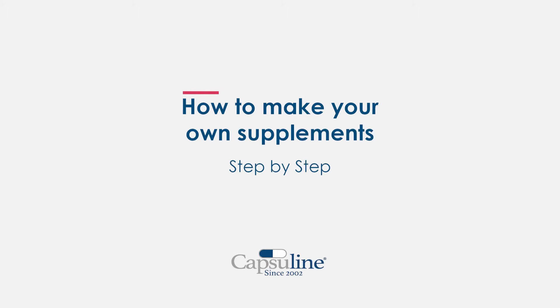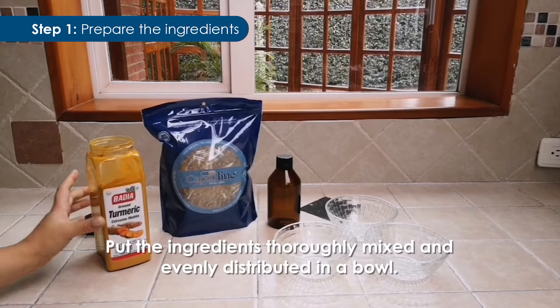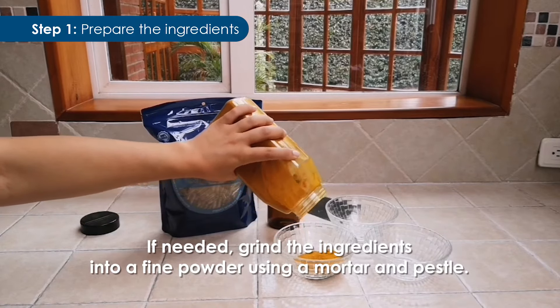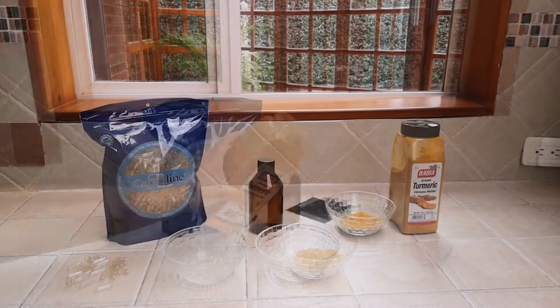Step 1: Prepare the ingredients. Put the ingredients, thoroughly mixed and evenly distributed, in a bowl. If needed, grind the ingredients into a fine powder using a mortar and pestle.